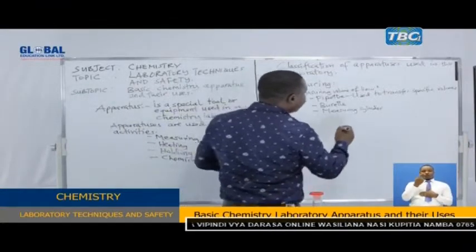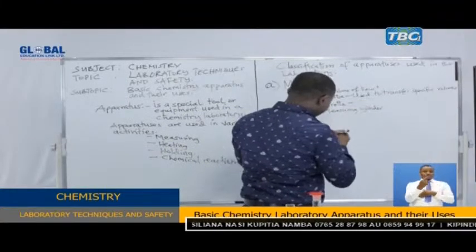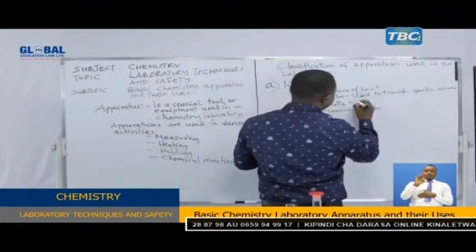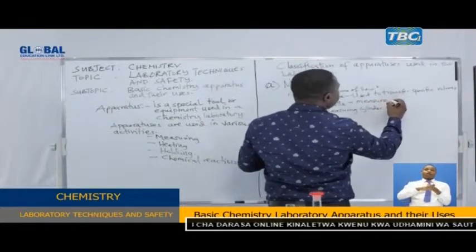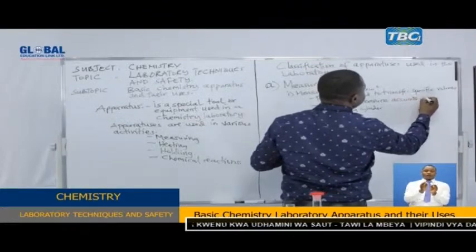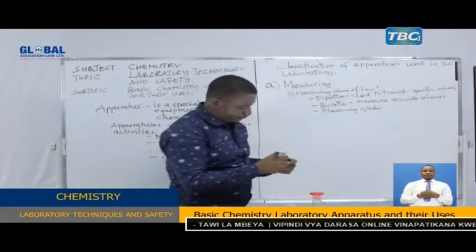Let us see a measuring cylinder. So, the burette, we said, is used to measure accurate volumes and dispense them.